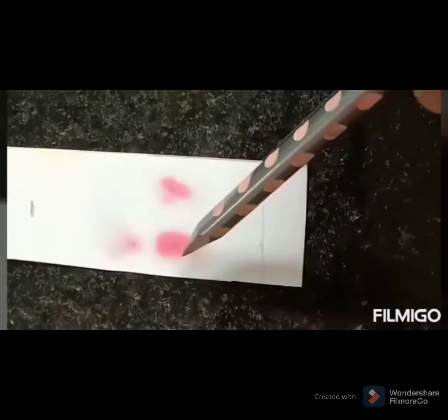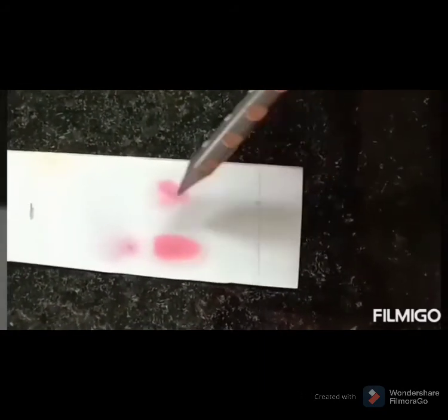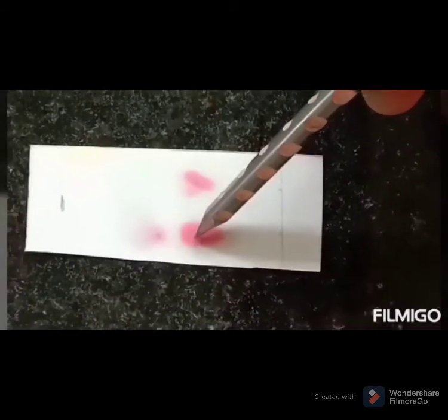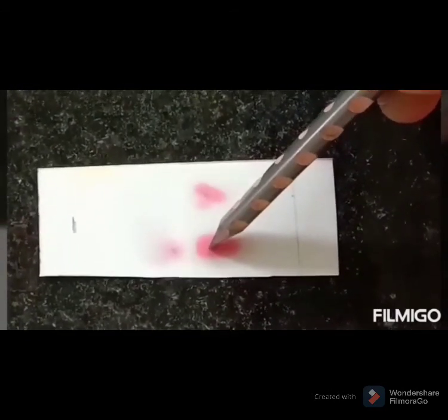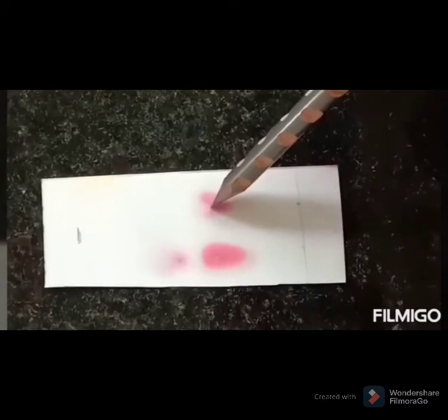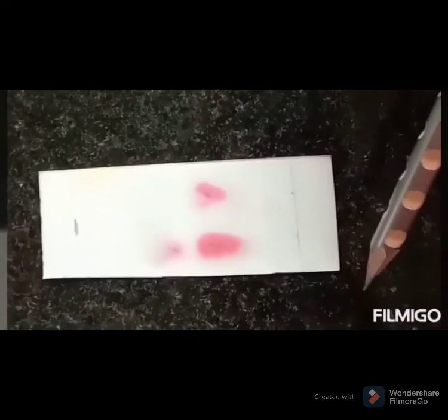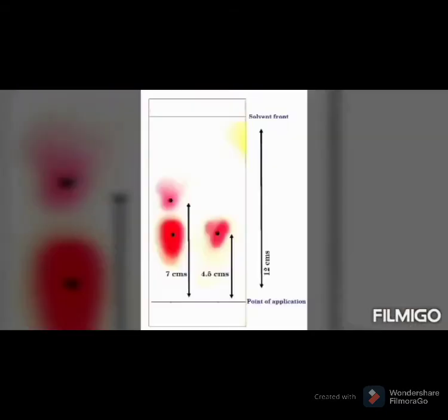Now you can see two spots representing two amino acids in the first point and a single spot in the test applied at the second point. The spots are reddish purple in color, which depends on the type of amino acid. Center points are marked to enable measurement of the distance moved, as well as the distance from the point of application to the solvent front.